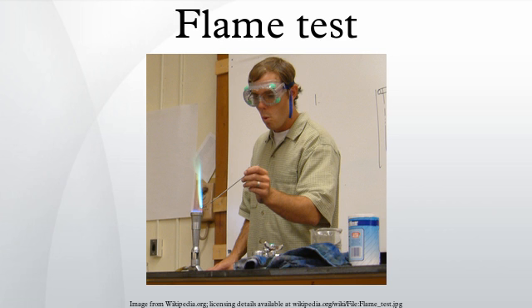put into flame. The flame test is a relatively easy experiment to set up, and thus is often demonstrated or carried out in science classes in schools. Samples are usually held on a platinum wire cleaned repeatedly with hydrochloric acid to remove traces of previous analytes. The compound is usually made into a paste with concentrated hydrochloric acid, as metal halides, being volatile, give better results.